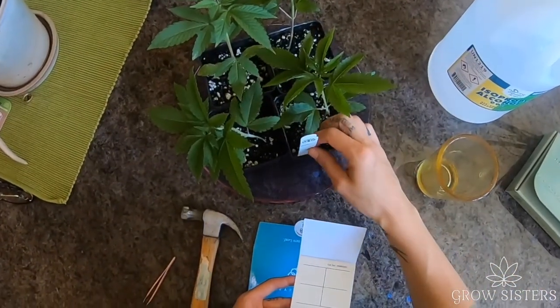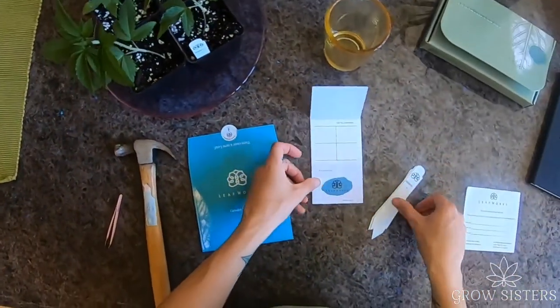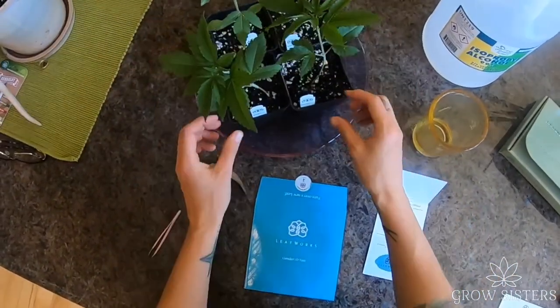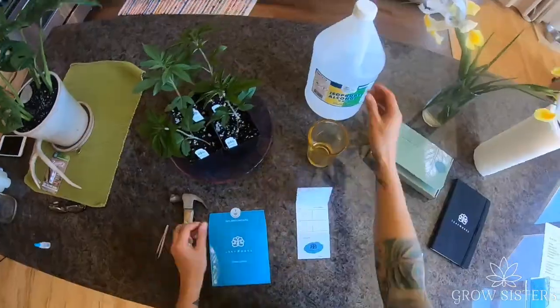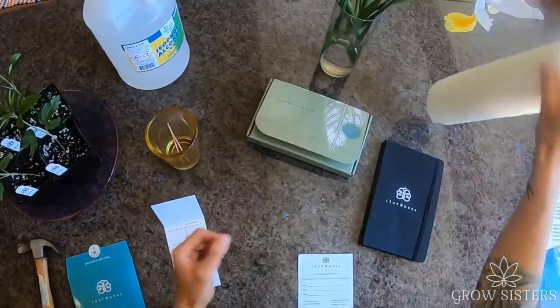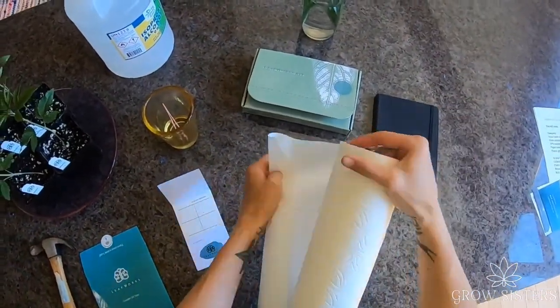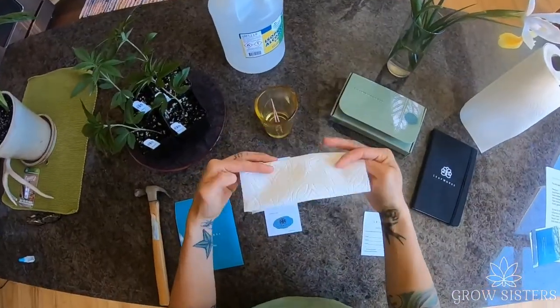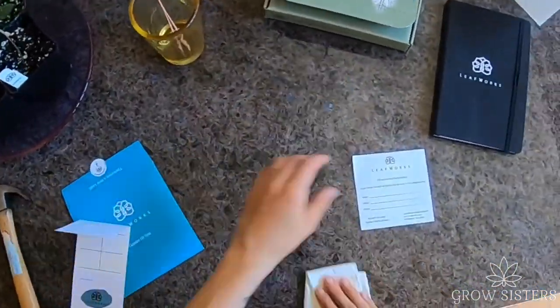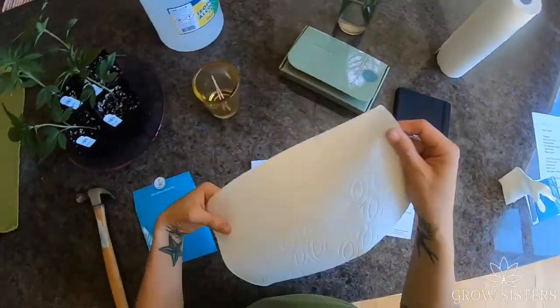Place one plant stake in each plant pot. Fill the cup with alcohol and sterilize the tweezers. Set up a clean workspace and completely dry the tweezers with a fresh paper towel.